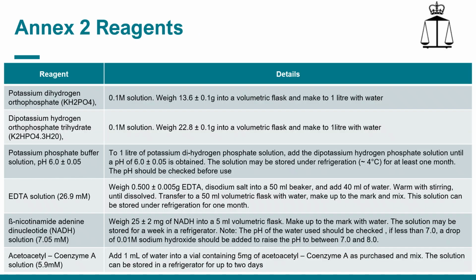Details of the reagents needed to undertake the procedure and how to prepare the solutions used in the procedure. General laboratory or analytical grade reagents, along with deionized water, are used in preparing all solutions.